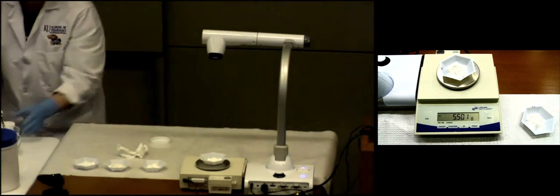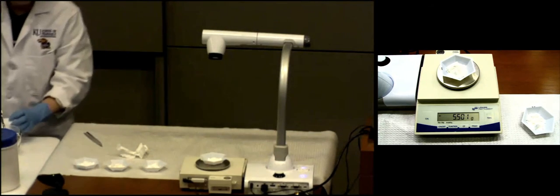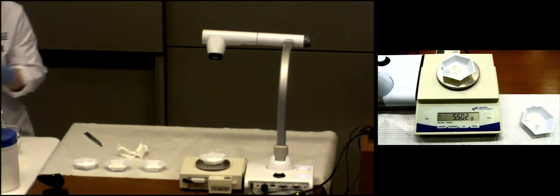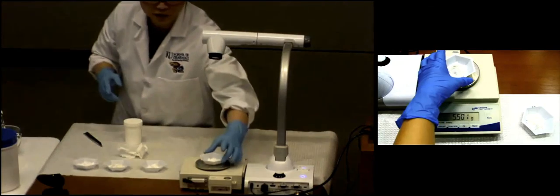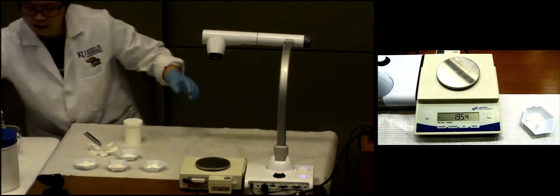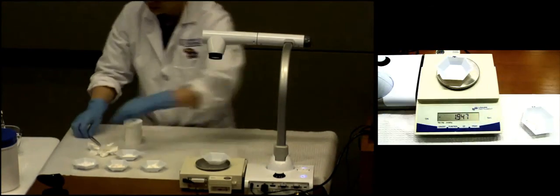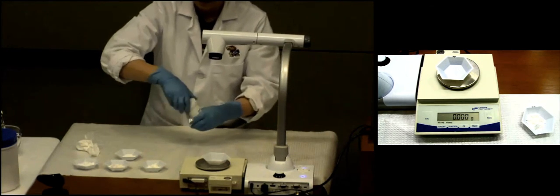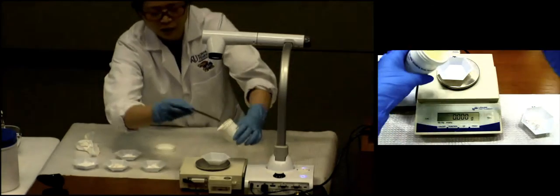Perfect. So for zinc oxide, 5.501. That's okay. 5.501. All right, we're close. Just need one more nice adding. All right, here. What's your target now? What is my target weight?